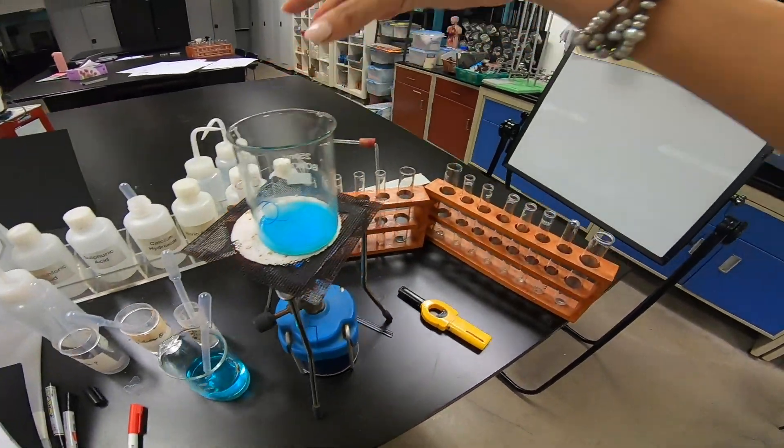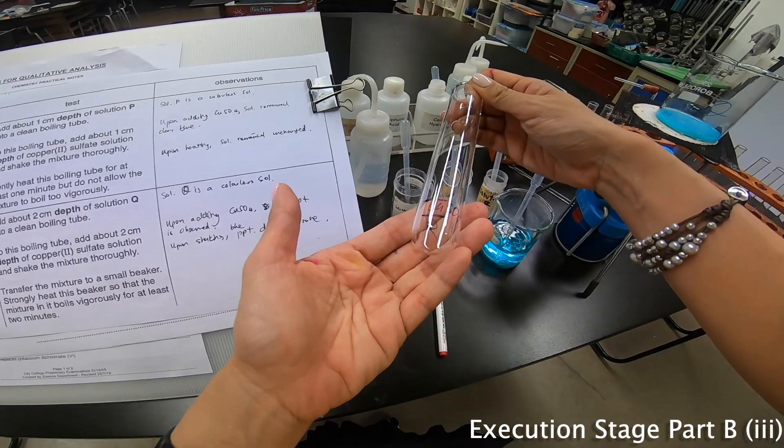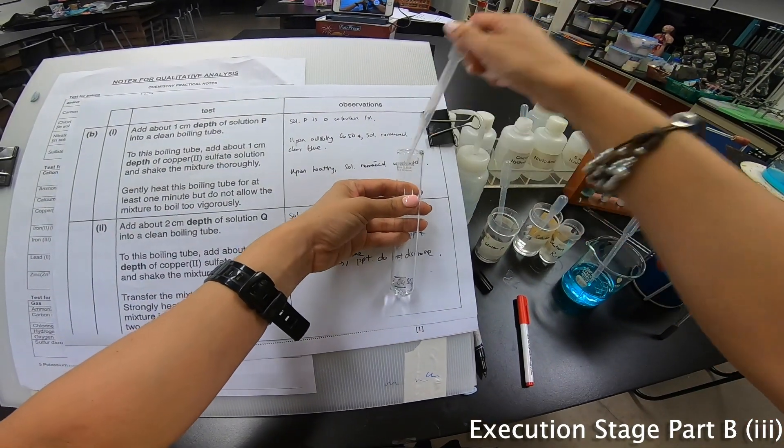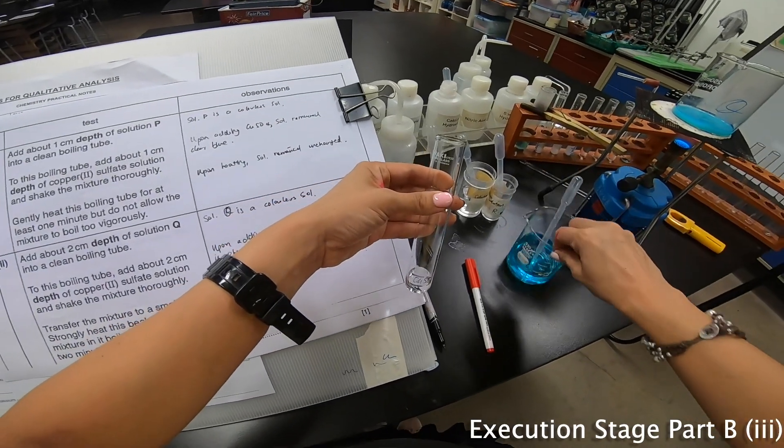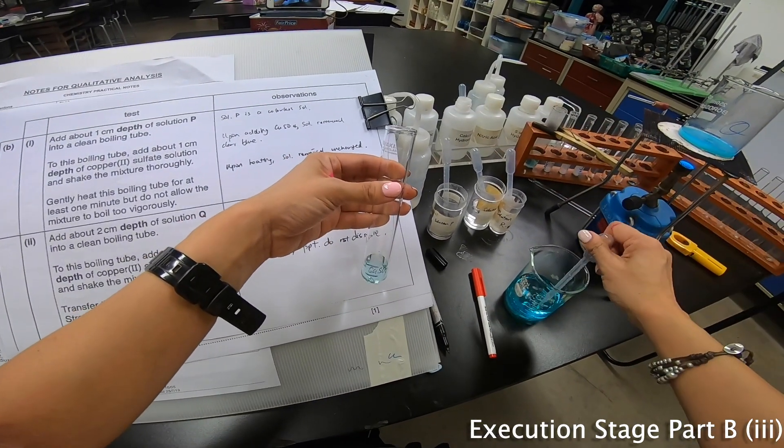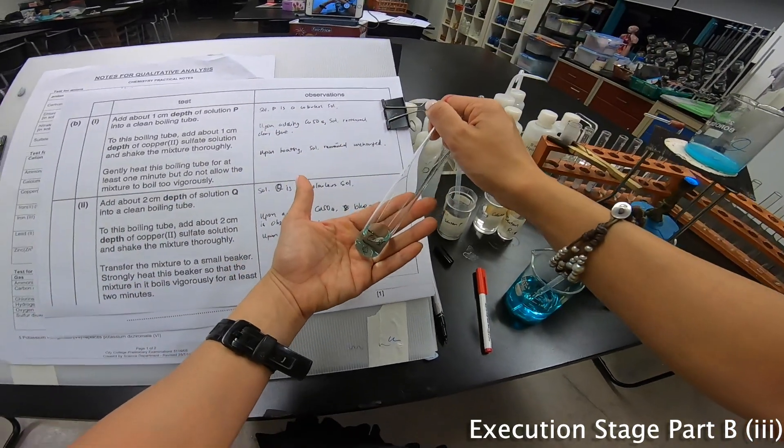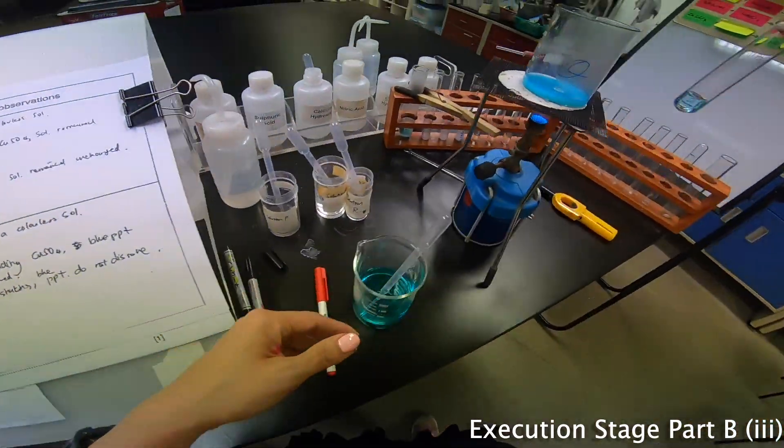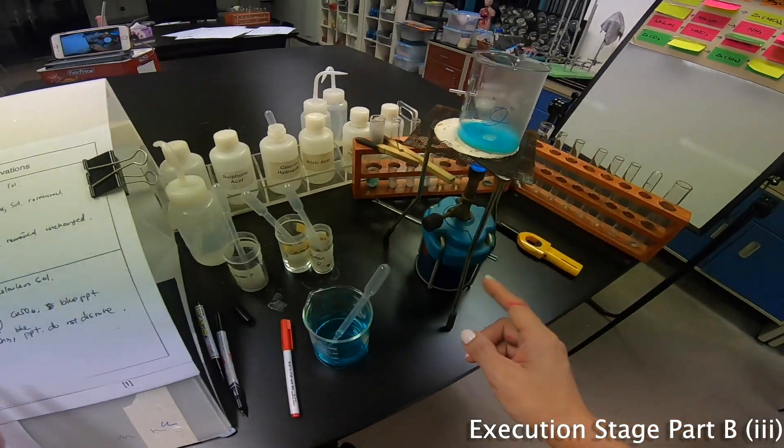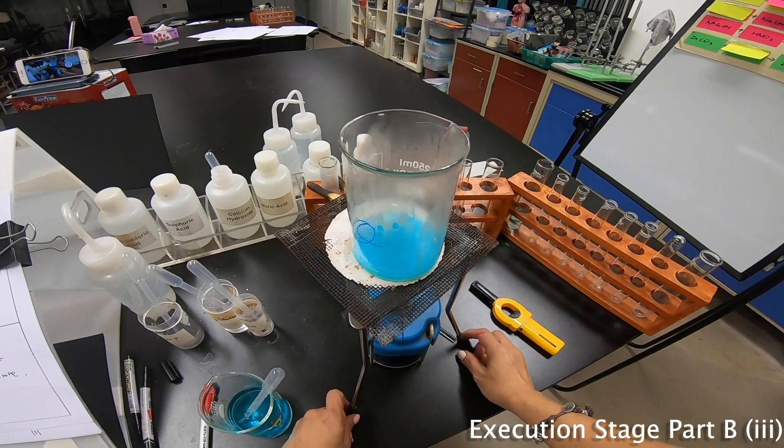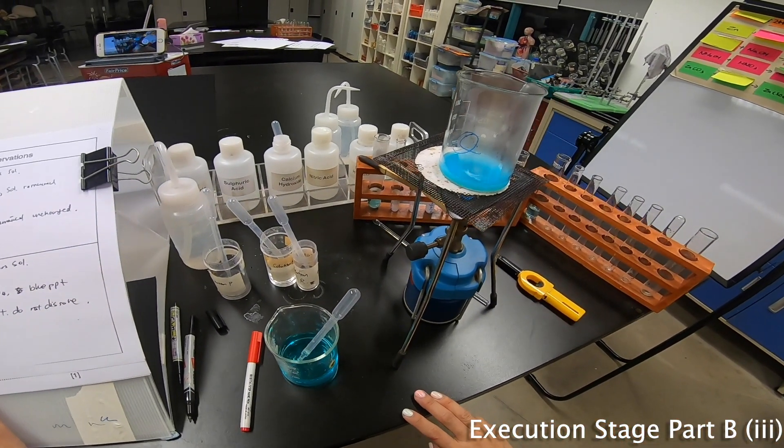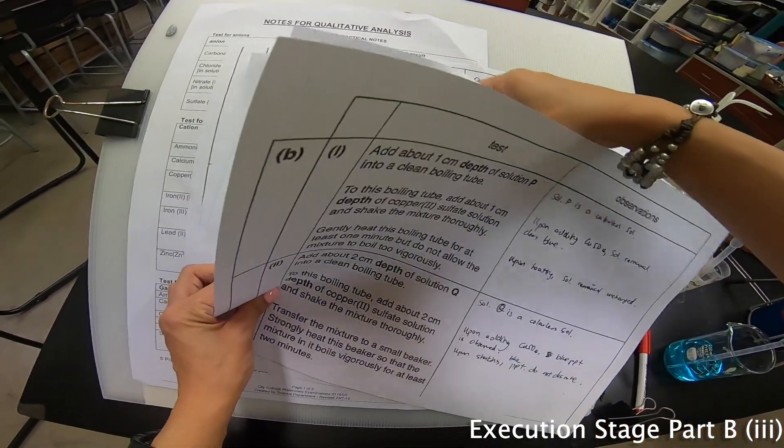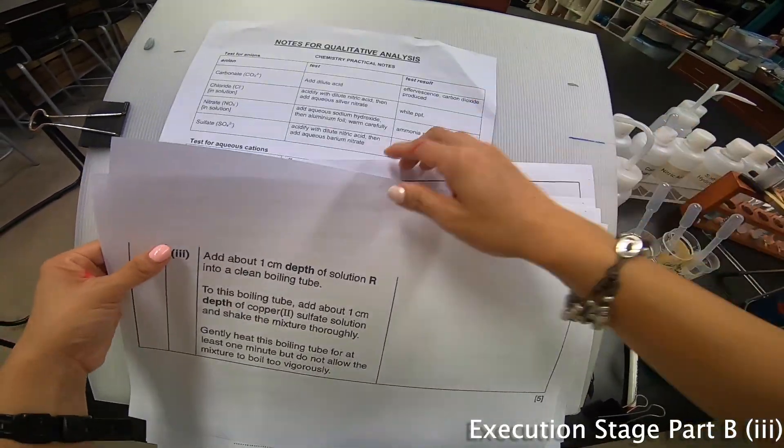Shake the mixture thoroughly. Upon shaking, blue PPT do not dissolve. Transfer the mixture and let's heat it for at least two minutes. So I'm letting it heat. So what is heating? Let me adjust this a little bit. I will move on to my next one, which is the last one, my R solution. So R is the same thing over here.